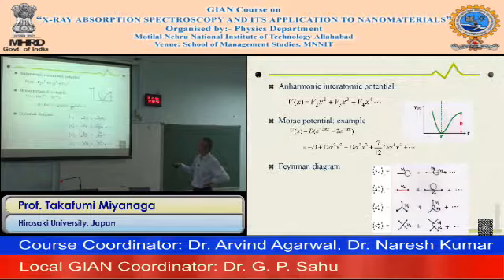The third order cumulant is almost the same as the third order potential part here. In the case of the Morse potential, d alpha cubed is this part. So we measure from EXAFS these V2 and V3, and dividing by these parameters, we can determine alpha and d.